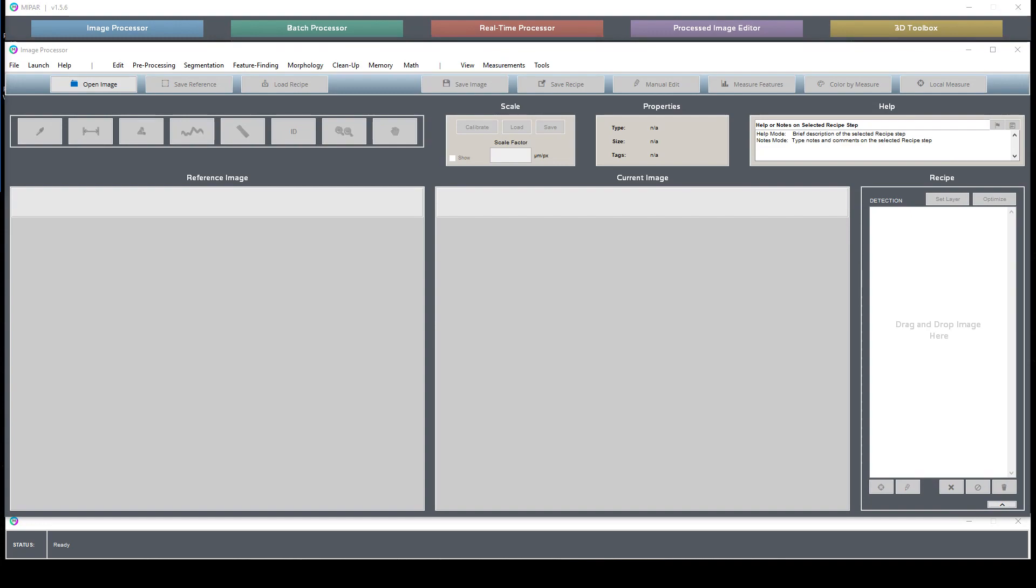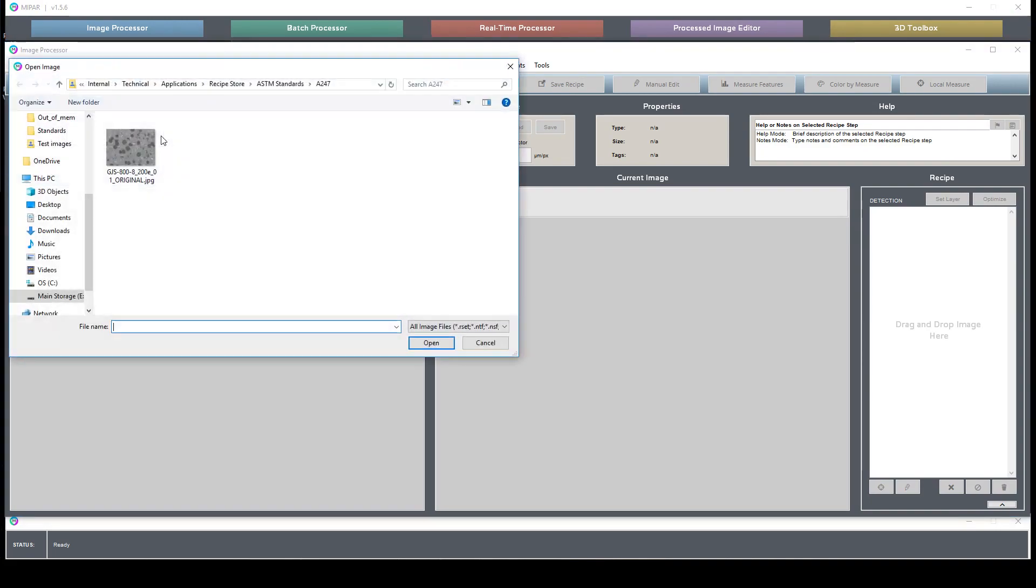This is a short overview of the ASTM A247 standard for graphite characterization in cast iron. I'm going to download the image that we're going to be using as a sample.